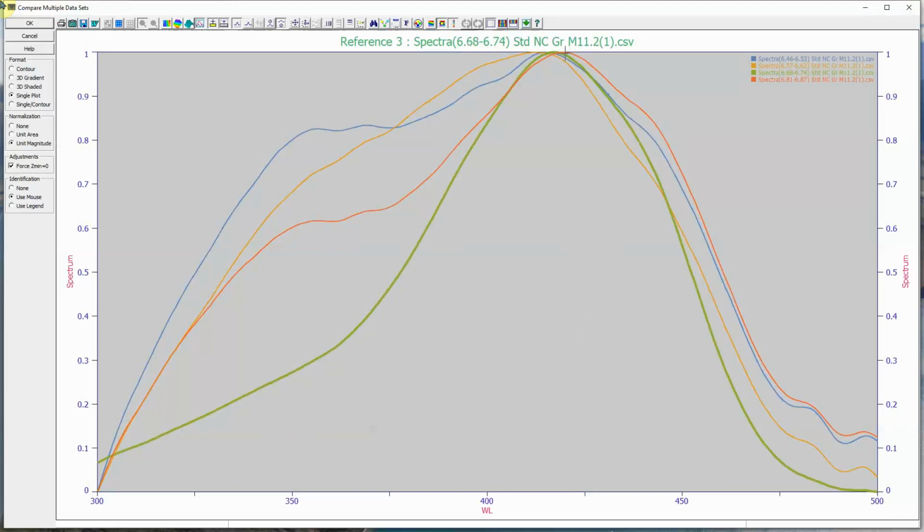You can see all four of these do absorb at a curcuminoid wavelength, but you see massive differences in terms of the UV absorbances between the four different components. So qualitatively, we know these are curcuminoids. Certainly, you have to do further analysis to determine what these individual trace components happen to be.